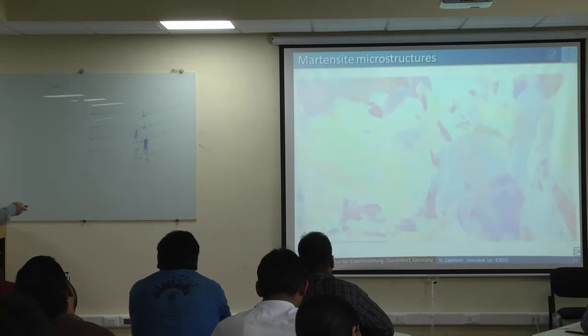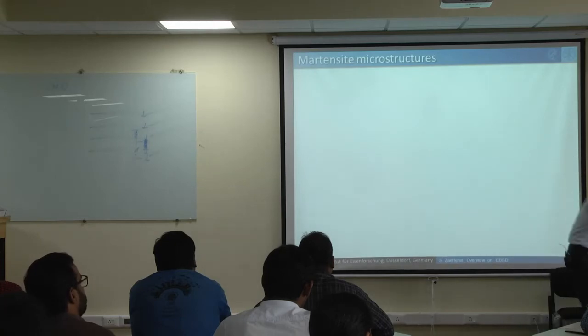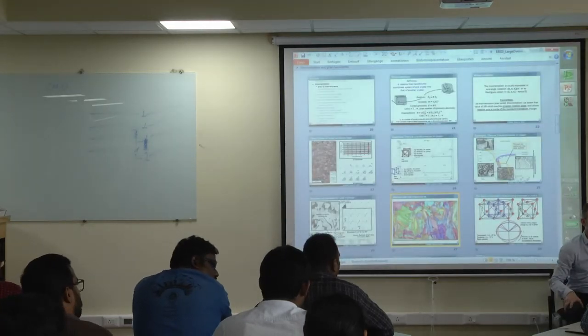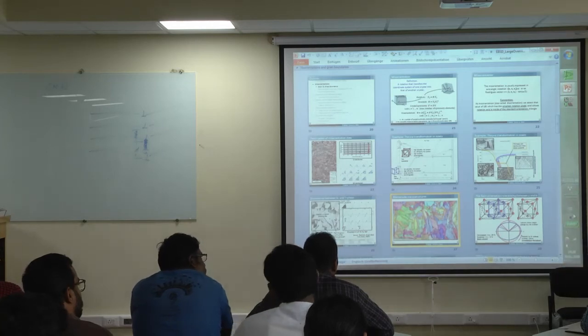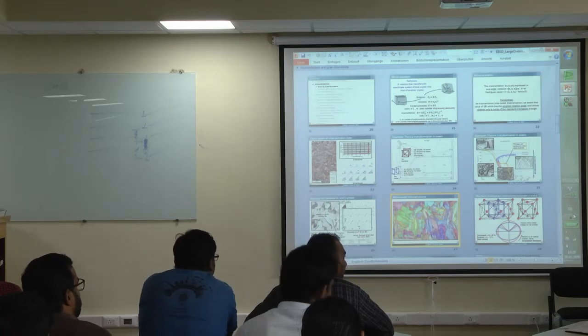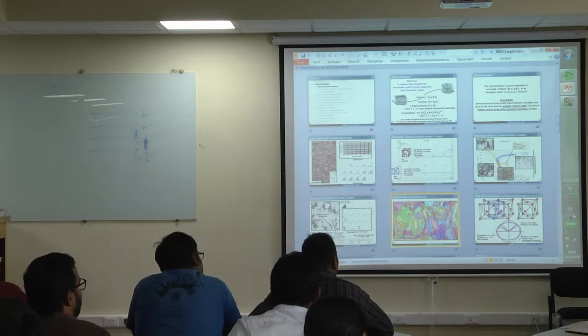Was there a question? No. Oh, good. This one we had seen already, and that's what I wanted to show you. Yes, please. You just commented about this martensite lattice. Yes, the form. How did we conclude that actually? You said from this picture which I just showed you, there is no martensite, of course. It's all bainite. Yes, but in a given hard microstructure, if you have martensite or bainite, how do you distinguish them? Ah, yes. What a bad question.